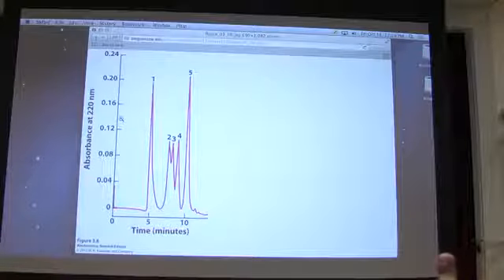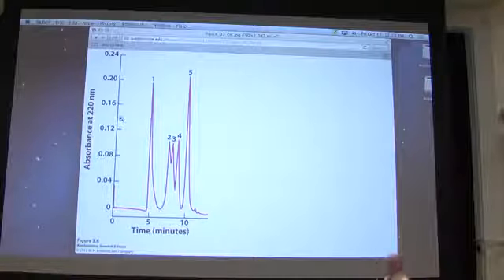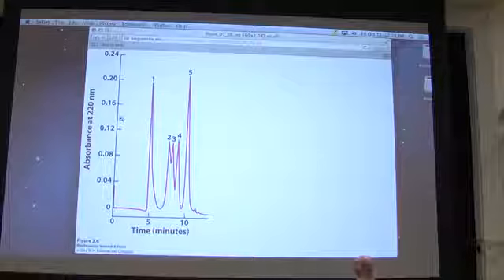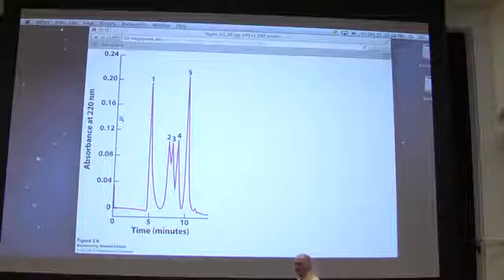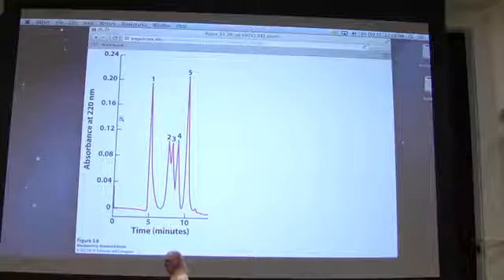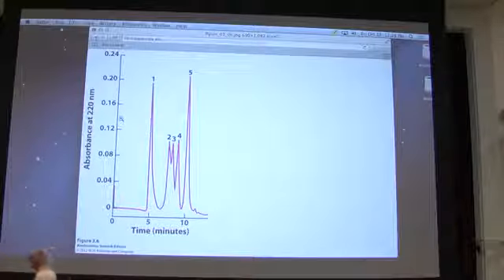Okay? People use HPLC because it's a very, very reproducible type of technology. So here's a mixture of 5 compounds that were separated by HPLC. And we can see at 5 minutes, the first compound is coming off. And over here at about 11 or 12 minutes, the 5th compound is coming off. If I take this mixture of 5 things and I run 15 different runs through the column, they will all look essentially identical to this. And more importantly, they'll all come off at exactly the same times that we see them on here.